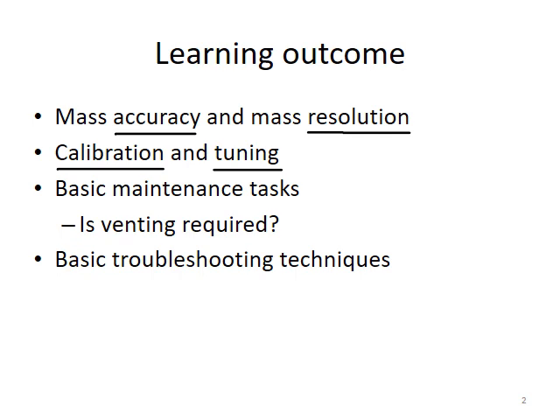And after this calibration and tuning, you need to learn a few basic maintenance tasks. These tasks will help you to prevent the instrument from contamination. I don't need you to memorize all the basic maintenance tasks, but you need to know for each of the tasks, is venting the instrument required? So for each of the tasks, you should know that.